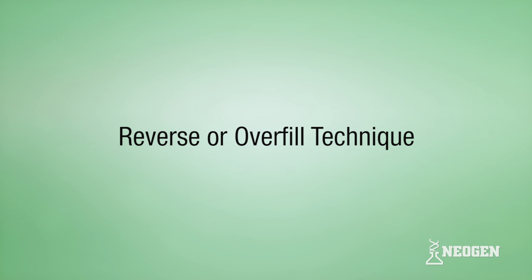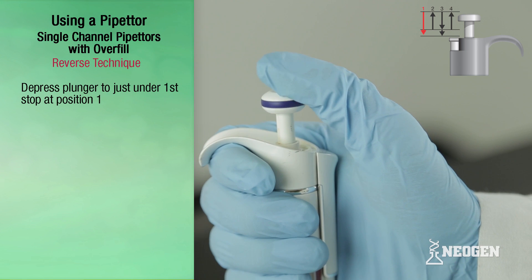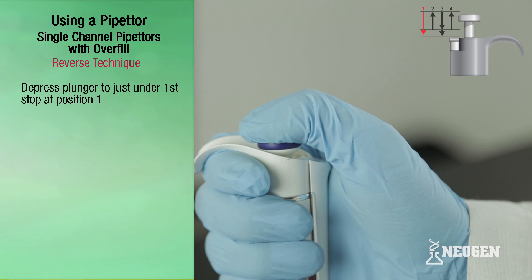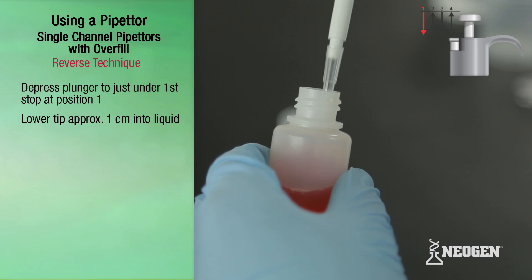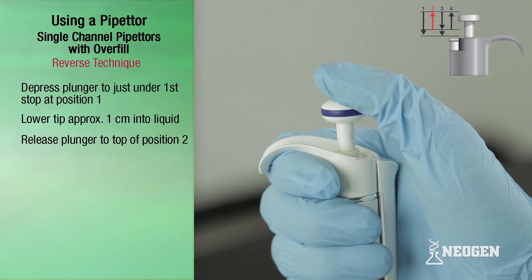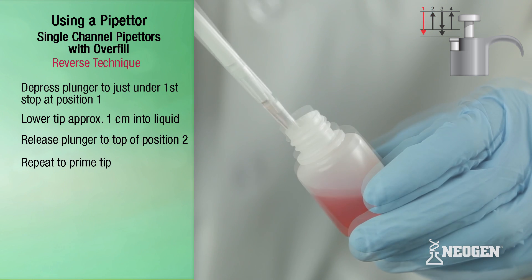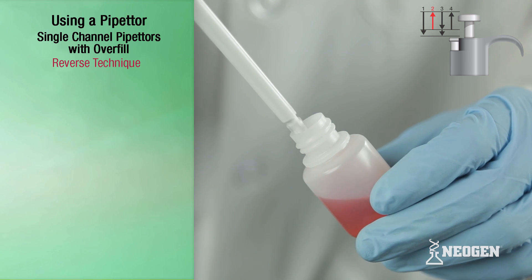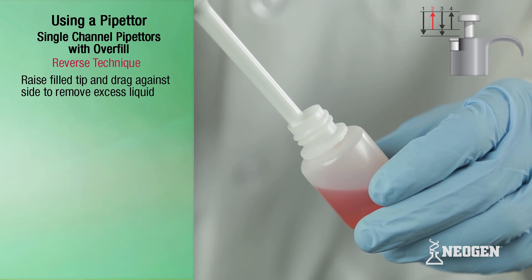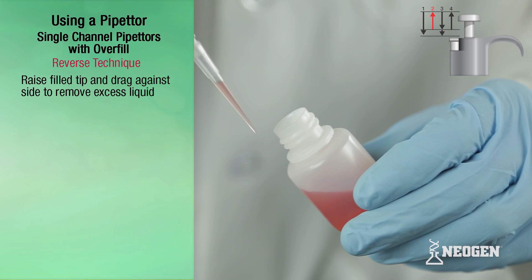Reverse technique, or overfill technique. After attaching a tip, depress the plunger knob to just under the first stop at position one. Lower the pipetter so that the tip is just under the surface of the liquid — about one centimeter — and slowly release the plunger knob all the way to the top of position two to fill the tip. Repeat steps to prime the tip. Next, raise the pipetter with the filled tip and drag the tip against the side of the container to remove any liquid on the outside. This is known as dragging the tip.